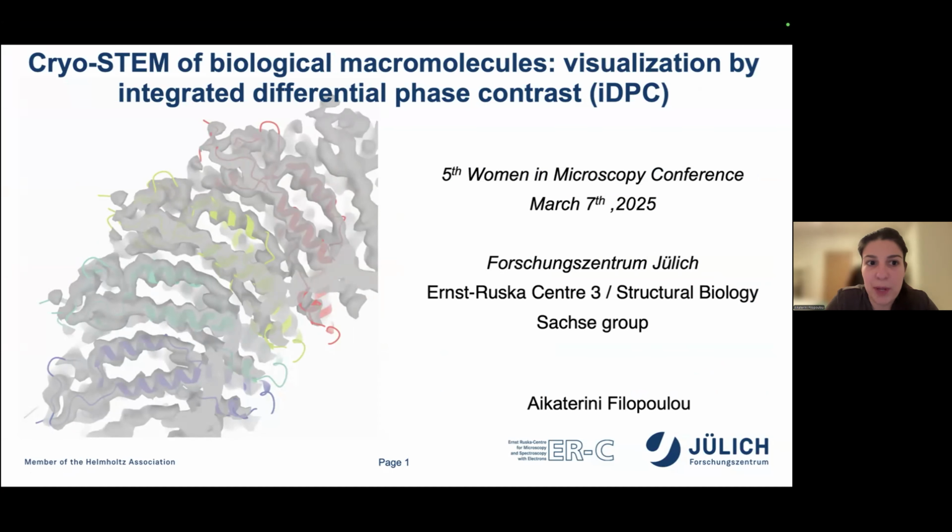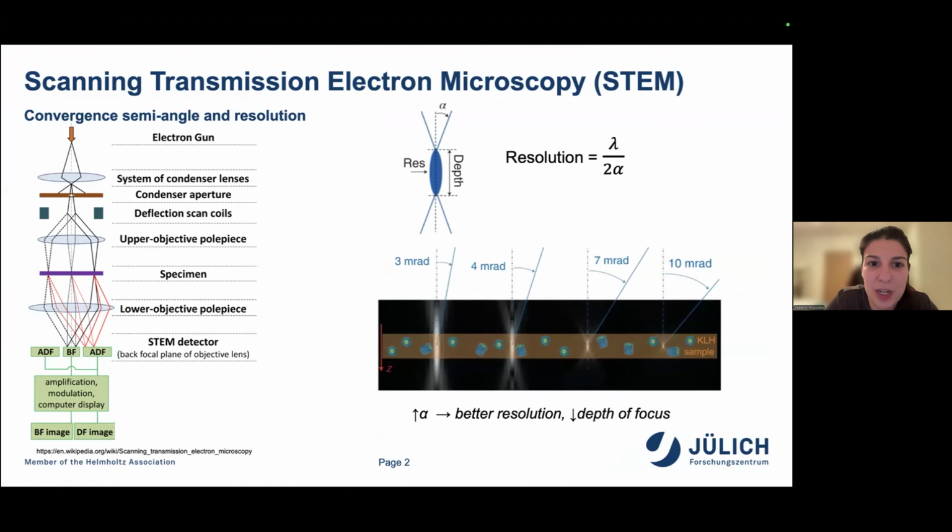And today I would like to talk about my project in cryo-STEM for biological macromolecules. And more precisely, the approach that we use is the integrated differential phase contrast. As I will talk to a structural biologist audience, I would like to give a bit of the background regarding STEM. So in scanning transmission electron microscopy, we need to focus our beam into a certain spot to have our probe, and then we are scanning our specimen. And after that, we are able to capture the signal that is a result of the interaction of the probe and the specimen. The advantage of this method is that we can collect simultaneously different kinds of signals in parallel. For example, the bright field signal, the annular dark field, etc.